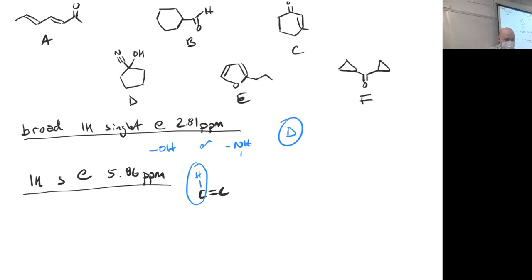So it's, well, good news, bad news. The bad news is there's multiple alkene containing molecules here. C. Okay, why do you say it's C? Because I just saw the 1 hydrogen.